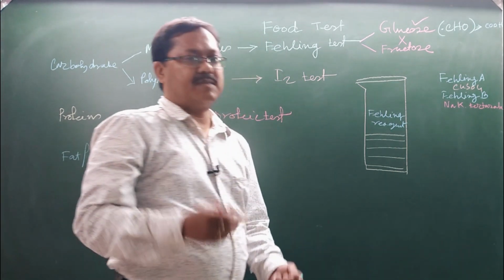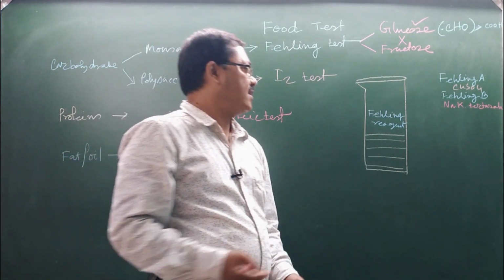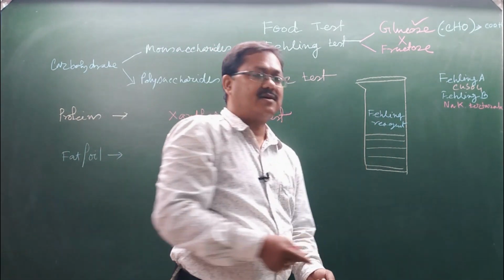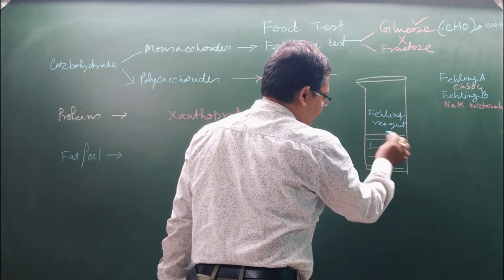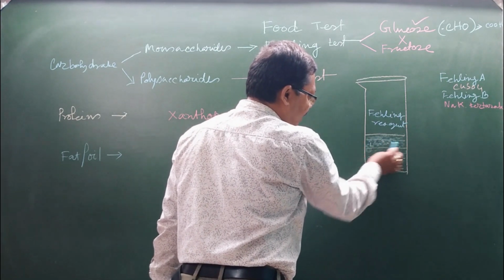These two compounds are mixed and added. The total content will be converted into blue-green color.